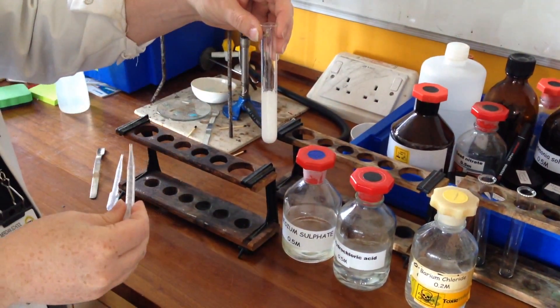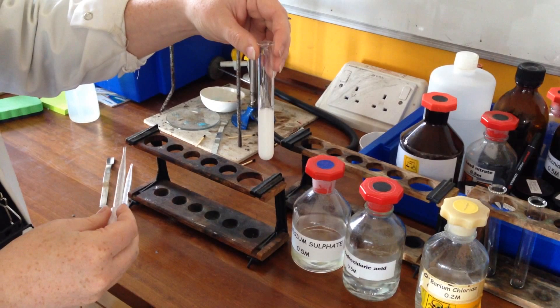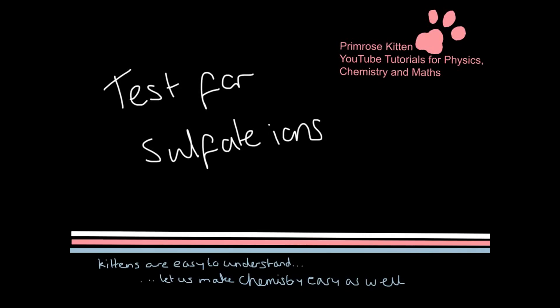And now we can see our white precipitate, which indicates the presence of sulfate ions. So here we tested for sulfate ions.